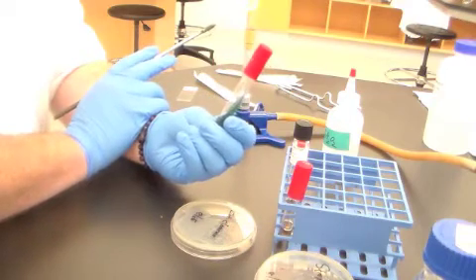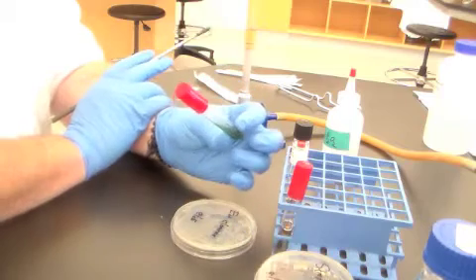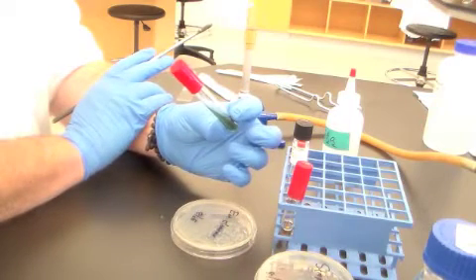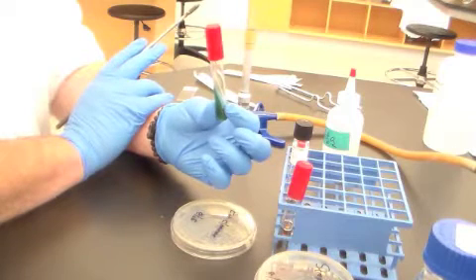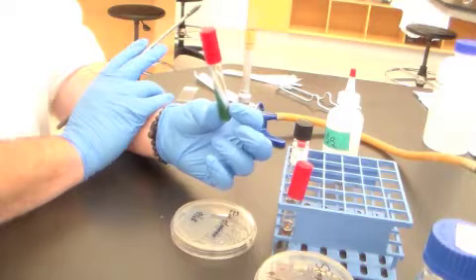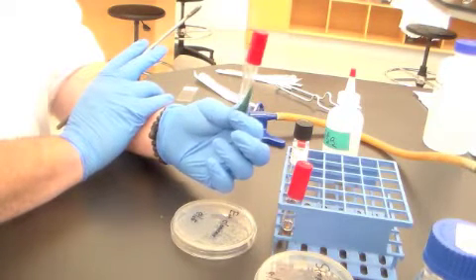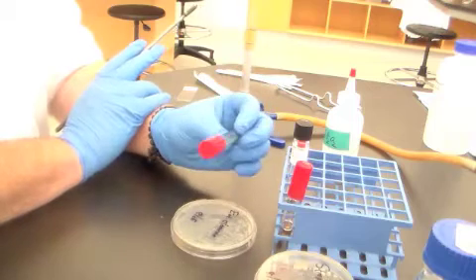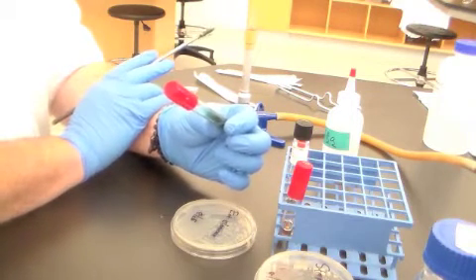But what's going to happen here is that as this grows, there's a pH indicator in here. You'll notice right now that it's green. If this bacterium can grow on this media using citrate, there's a pH change that will occur that will produce a beautiful royal blue color. It will change from green to blue. You may not actually see the growth on a Simmons citrate agar slant.